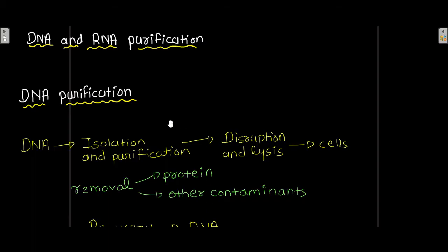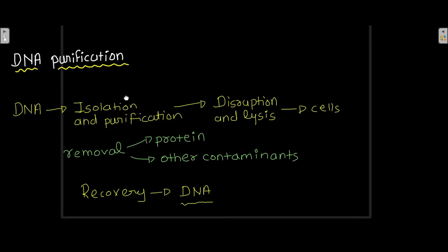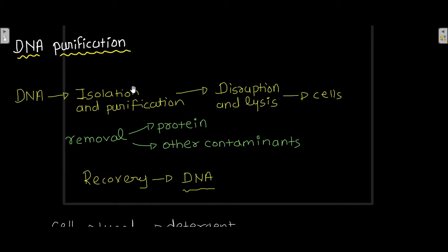In this video, we are going to discuss DNA and RNA purification. Now let's start with DNA purification.